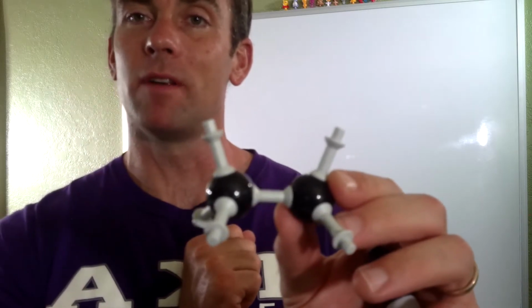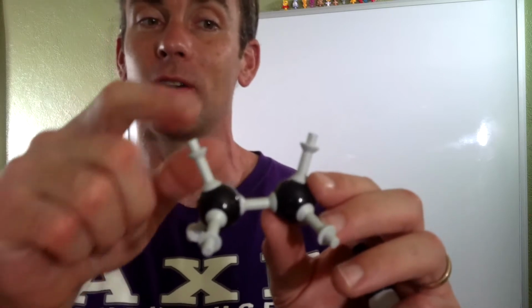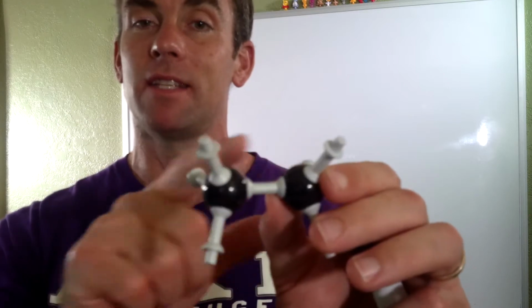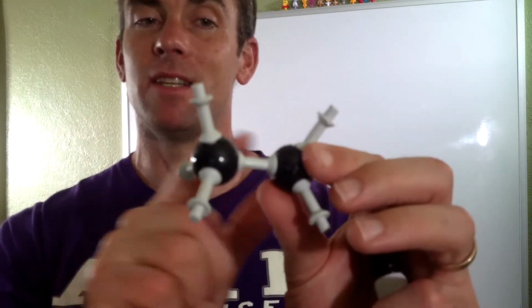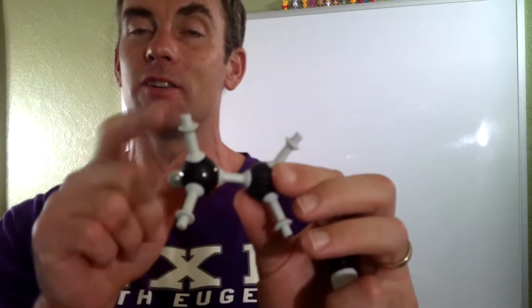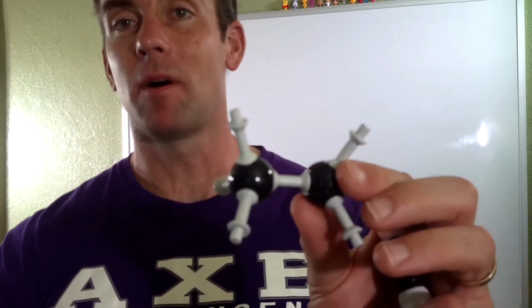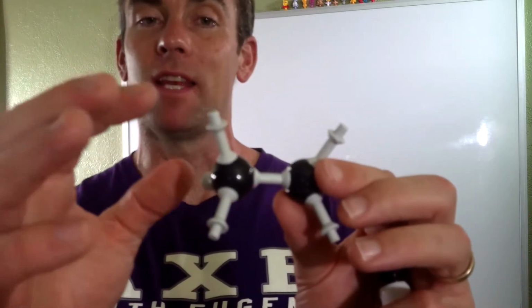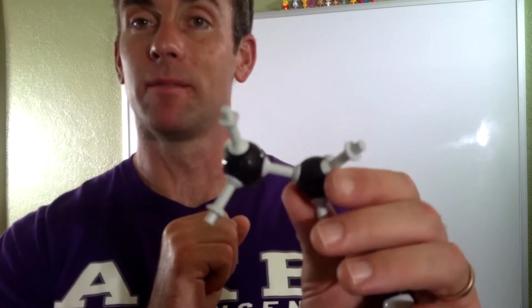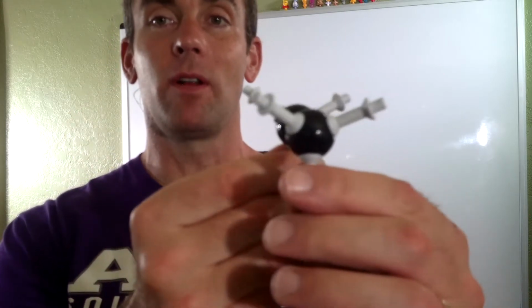That's 1 carbon environment. Of course, in this particular lab, we're not talking about proton NMR, but it turns out that the same symmetry plane that relates these 2 also relates these 2 and relates these 2. And so what that means is that since all of these hydrogens are equivalent, you also would get 1 peak in the proton NMR, having to do with the fact that each one of these hydrogens is a symmetry equivalent.